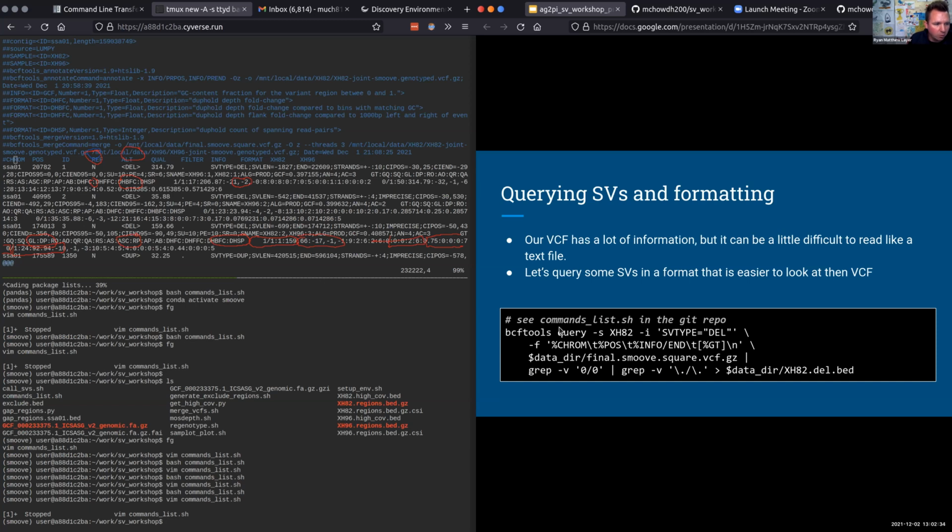So I'm not going to go through any more, but if you think I moved the line, my circles are no longer lining up, at least on my end. I'll just clear that. All right, so just to give a little bit of a tour of a structural variant VCF, they do look quite a bit different than a SNP or indel VCF.